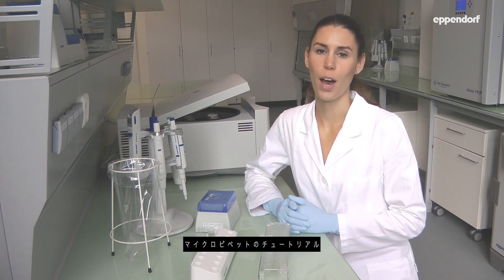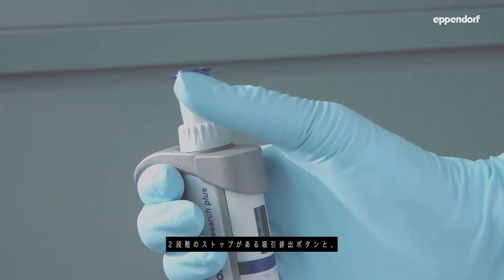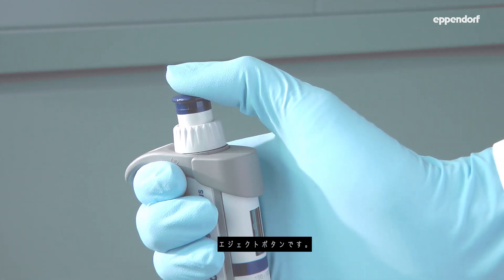Welcome to the pipetting tutorial: How to Pipet Correctly. I am using a two-button pipette. It has a control button with two stops and an ejector button.